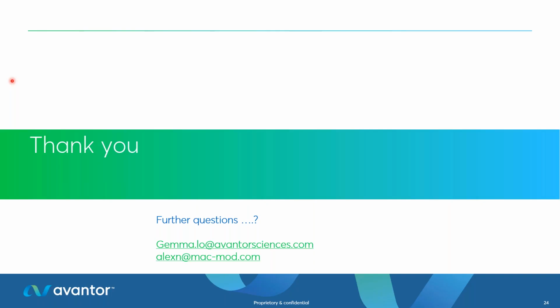Okay. Is it just the column chemistry that's important for selectivity? No, there's lots of other factors. I think the first webinar we did touched on things like the mobile phase, your organic modifiers, your pH, all of those factors. And if you're running gradients, then all of the column dimensions come into play as well. So there's lots of factors that affect selectivity. The column chemistry is one of the biggest ones, or is the biggest one.